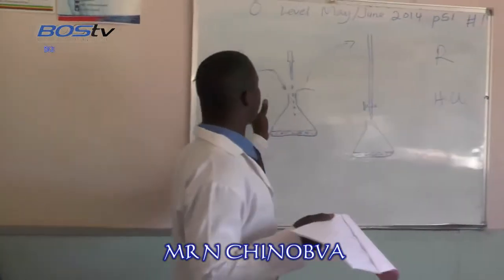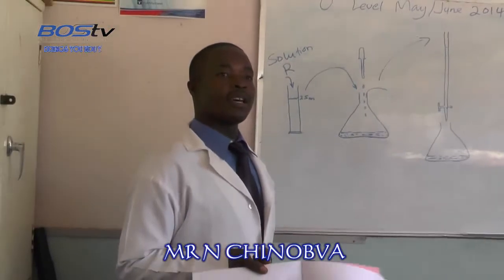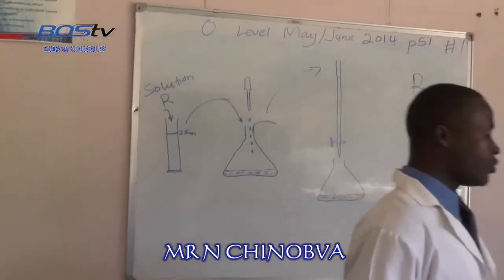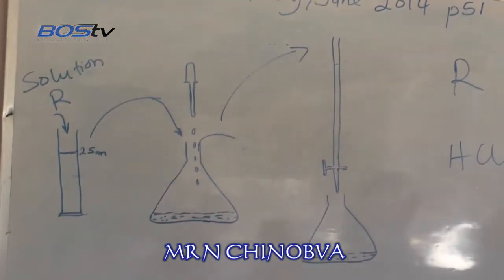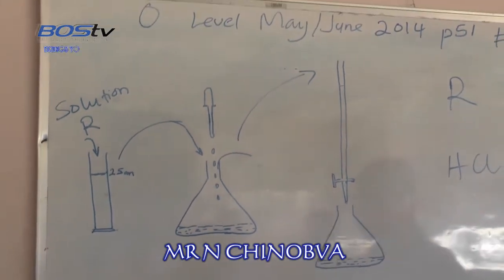This is your setup. You are going to measure and provide a solution R. That solution contains two alkalis. We are going to do a double titration in which we use the same reagent vessel to carry out two different titrations. That means we are going to get two different endpoints.